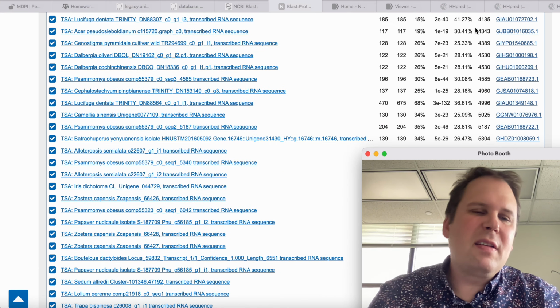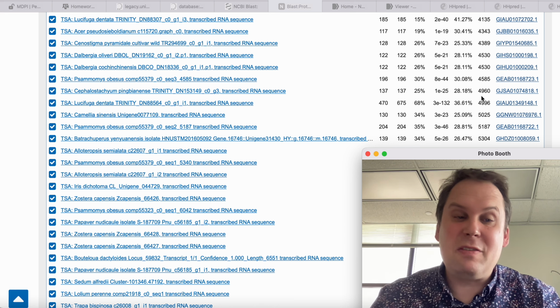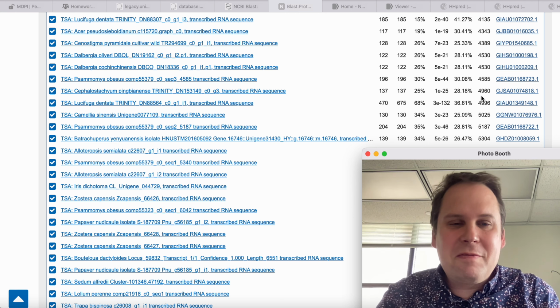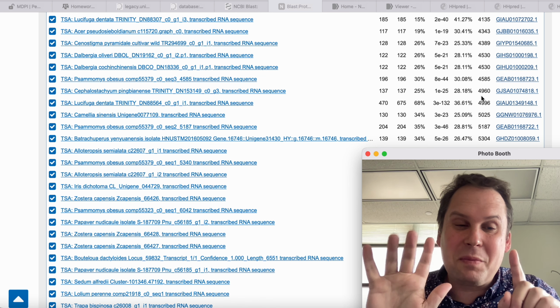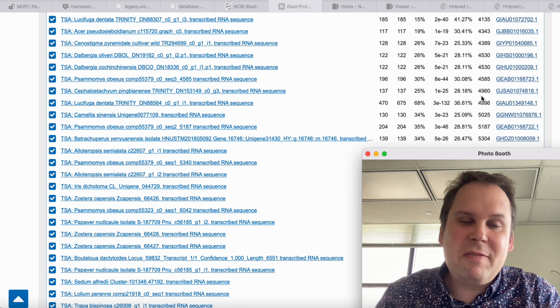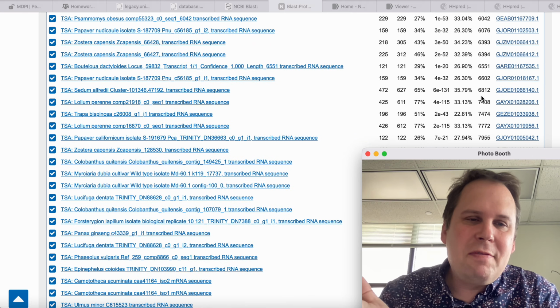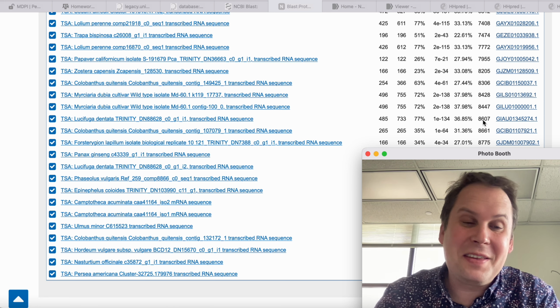The things that are smaller are probably fragments. Like a 4,900 is probably about half a genome. You can search any of these, but if we're looking for all the parts, you'll actually find all of the parts. There's 6 parts that we want to find, and a complete virus should have all 6 of the parts. There's no guarantee: if you pull out one that's 8,500, maybe the full virus was 13,000. Maybe you've only got part of it still.